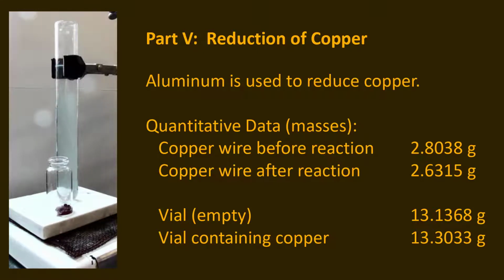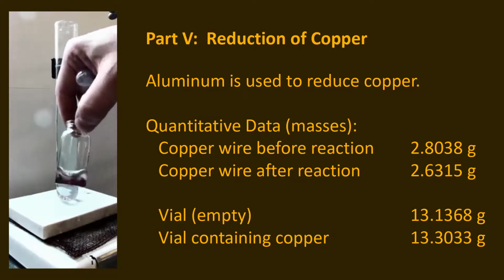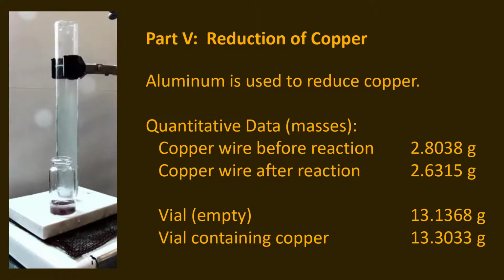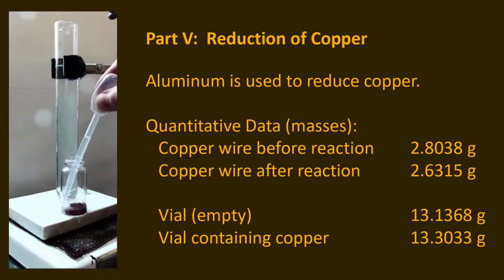we're adding some cyclohexane. Now, cyclohexane doesn't have any hydrogen bond donors or acceptors and isn't soluble in water, and you can definitely see how it's forming kind of a weird separation there. But the point is that adding the cyclohexane gets rid of, because ethyl acetate and methanol are both completely miscible with cyclohexane, the cyclohexane will get rid of those two solvents that we just added.